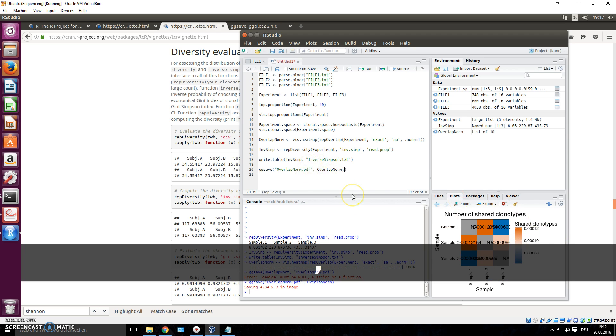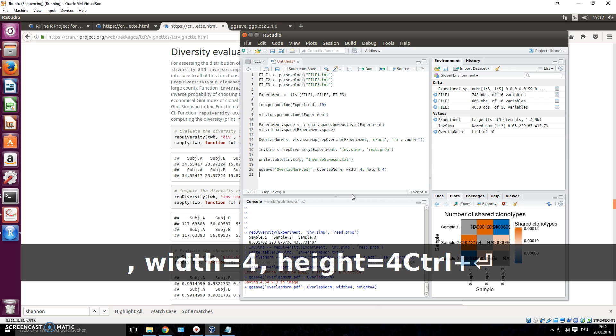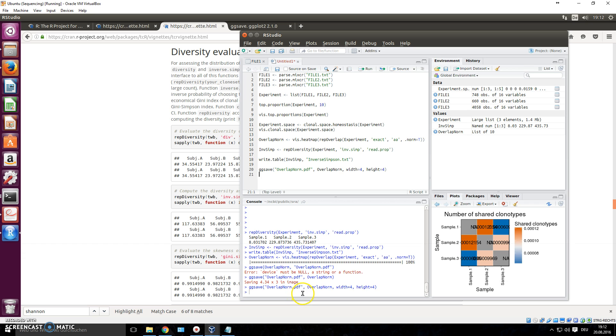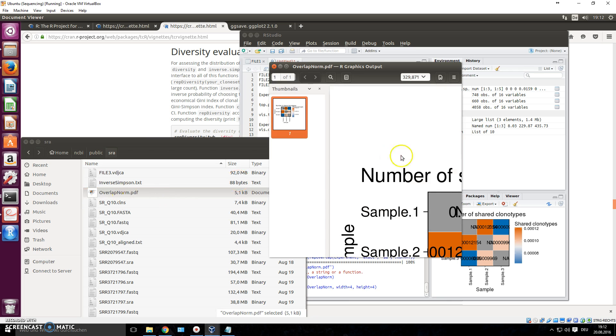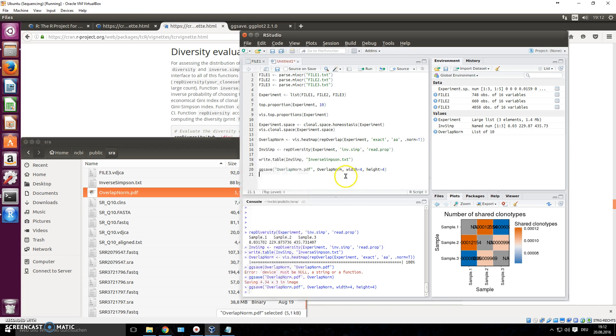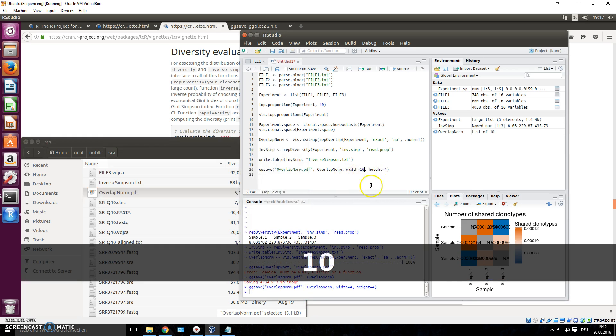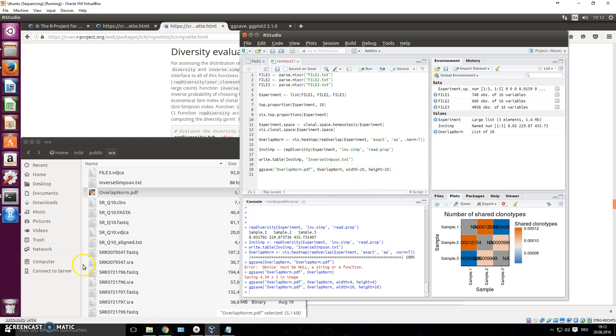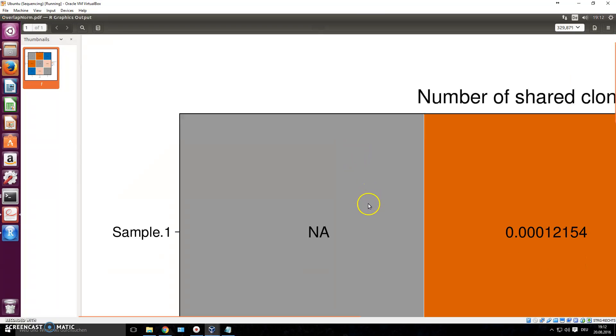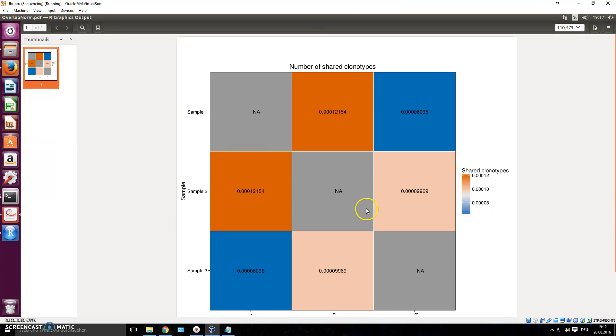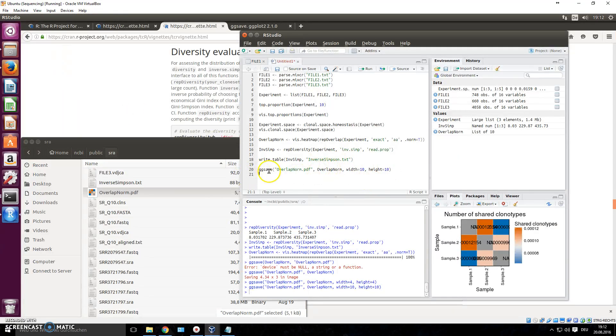But you could also write down width, let's say, or height, four, and then do the same thing again. Something should have been saved now. Let's check if it changed. Not so much. Let's try this 10, 10. Maybe. There we go. Looks much nicer, right? So that's how you change the size as well. Now it's huge. But you know, find whatever works for you. And then you save it like that.